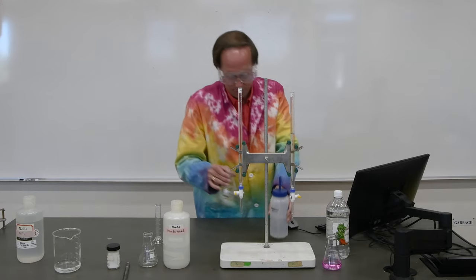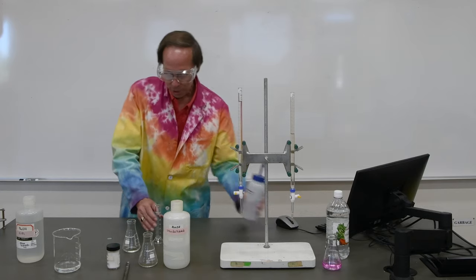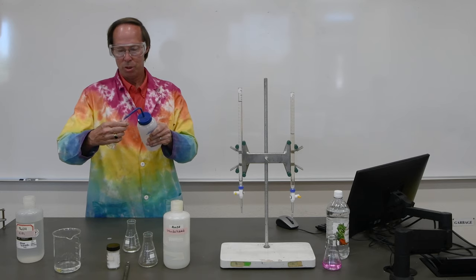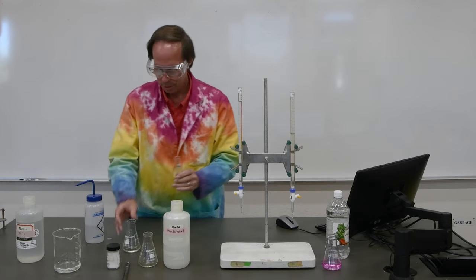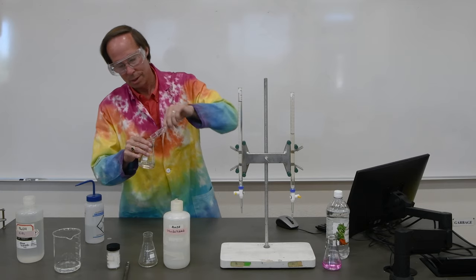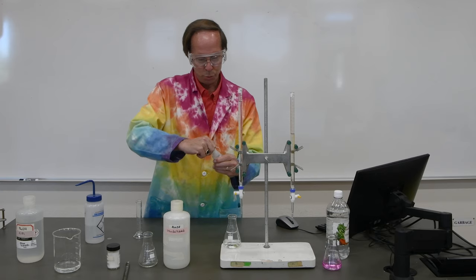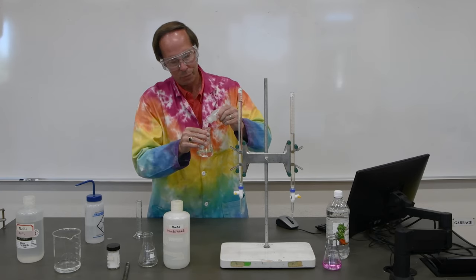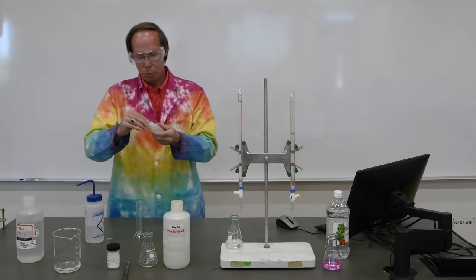There we are. Now, as we did in the previous one, let's add some deionized water just so we have a bigger volume to look at when we're watching for that endpoint. So we'll just put in an extra 25 milliliters of deionized water. And swirl that around, and then we'll add a few drops of phenolphthalein. There we go.